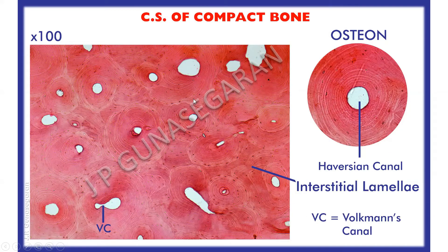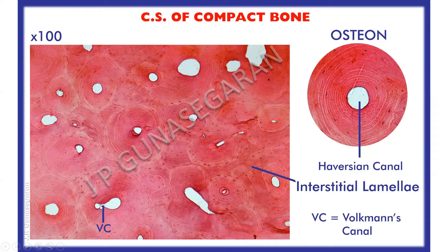This is a decalcified section of compact bone. In this process of decalcification, all the inorganic salts are dissolved to make the bone soft, sectioned with the microtome, and stained with hematoxylin and eosin. So this is a stained section, whereas the previous one was an unstained section. Even after decalcification, the general architecture of compact bone is preserved — you have the Haversian systems, the interstitial lamellae, and the Volkmann's canal connecting the Haversian canals.